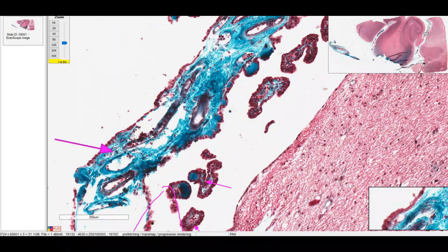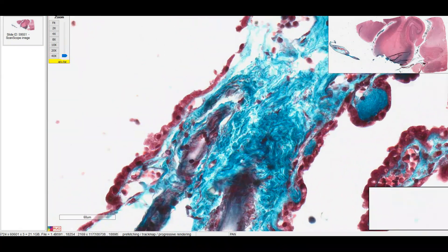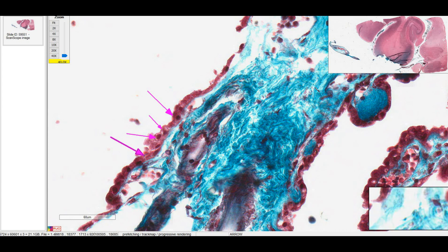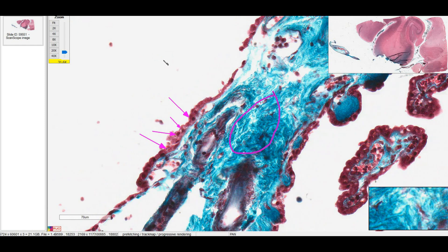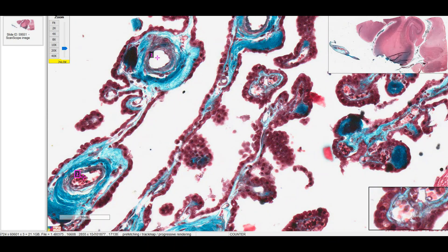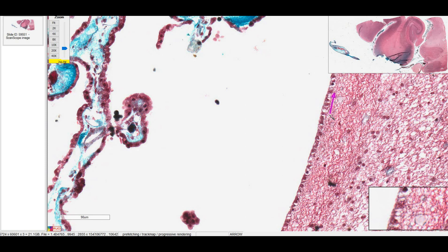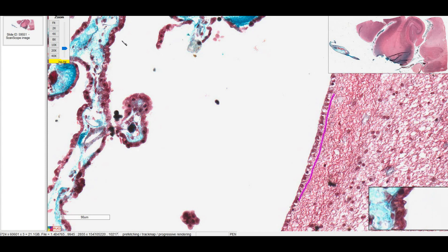The lab manual talks about how this is inside out compared to the rest of the brain. And what they're talking about is on the outside of the choroid plexus, you have the ependymoglial cells that are creating CSF. And in the middle is pia mater. So before we saw that the pia mater was kind of on the outside of the brain and the spinal cord, but here it's on the inside. And notice that within the pia mater of the choroid plexus, there are lots of blood vessels as well. And also note that where brain tissue interfaces with the ventricles, it's lined by ependymal cells. So that's what these guys are here. They do look a little different from the choroidal ependymal cells though.